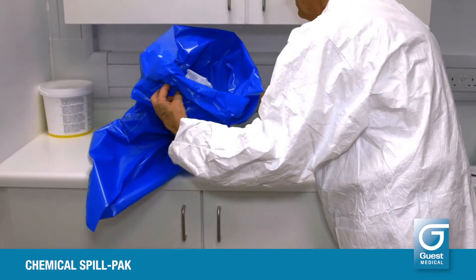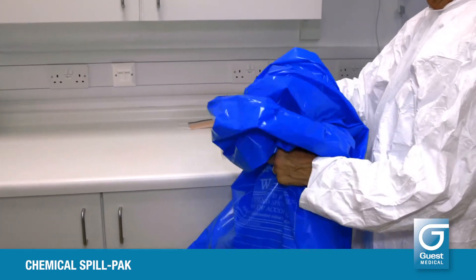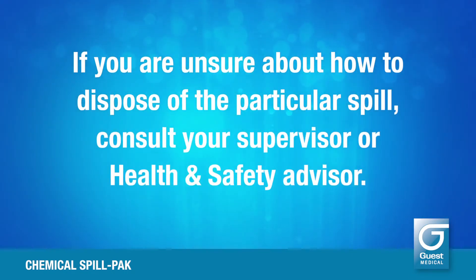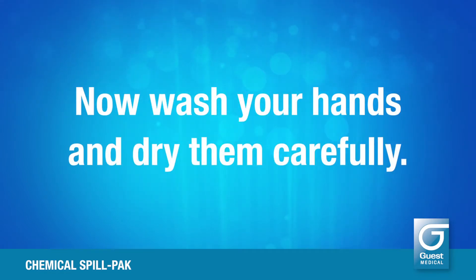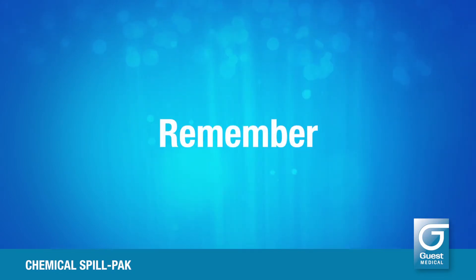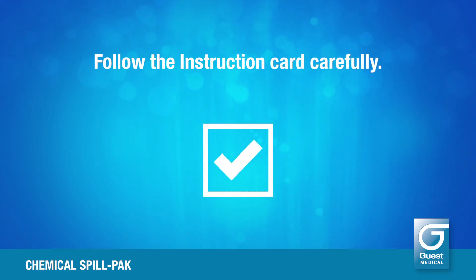Only touching the outside of the bag, secure the opening with a tie and discard the whole thing into the appropriate waste system according to the chemical spilt. If you are unsure, consult your health and safety advisor. Now wash your hands and dry them carefully. Follow the instruction card carefully.